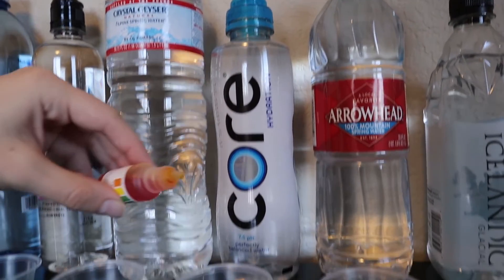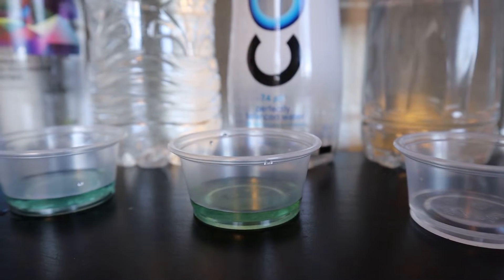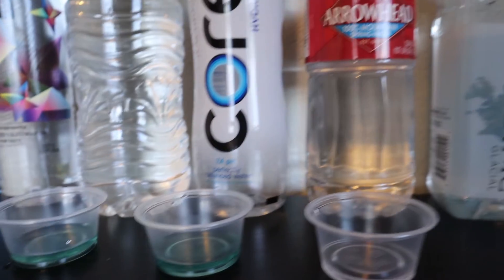Now for another electrolyte water that claims it's free from fluoride, chromium-6, MTBE, arsenic, and chlorine. This is looking like it's an 8 to me.